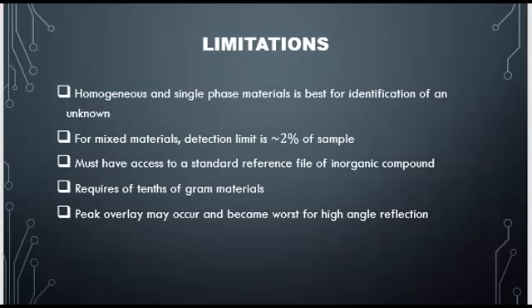So if there are any elements present that make up less than 2% of the sample, then they cannot be detected. Once a peak is collected, there must also be a reference file in order to identify what that material is based on that profile.